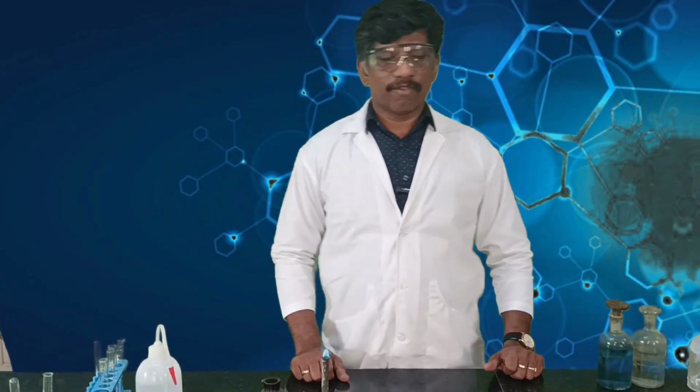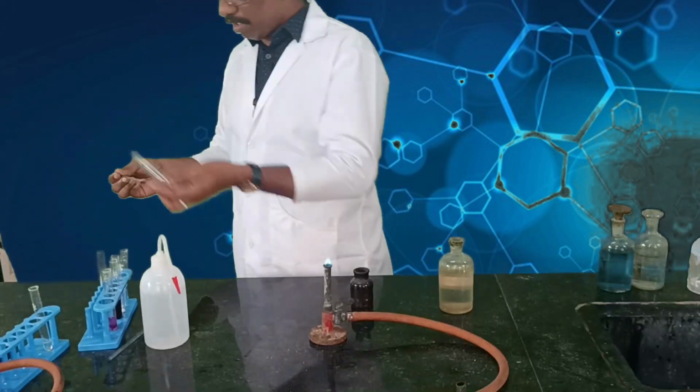Now we shall see the confirmatory test for carbohydrate. To confirm the carbohydrate, we are doing a test called Molisch test. Before you do this experiment, we need alcoholic alpha naphthol. Before we start the experiment, let us prepare. You take alpha naphthol and dissolve it in alcohol. That is alcoholic alpha naphthol.